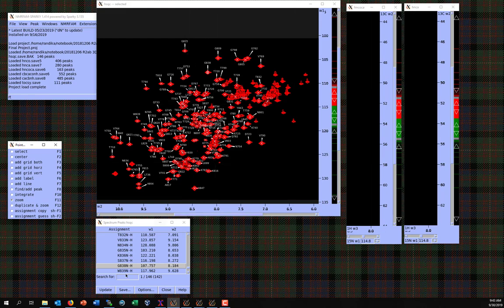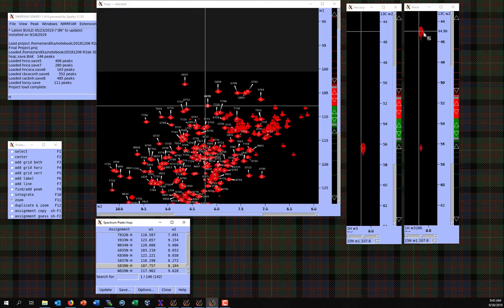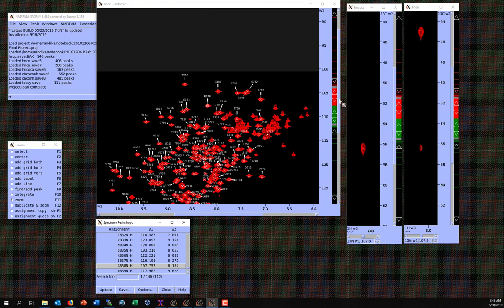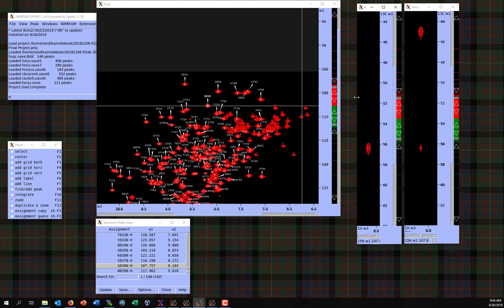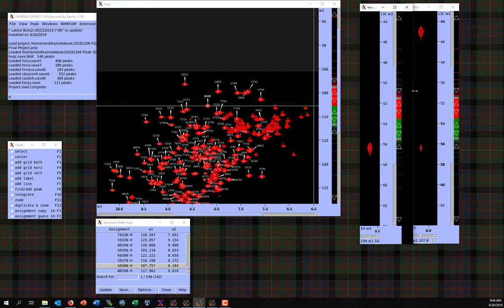So now what we need to do is start finding these residues. We're going to start with residue 838. As you can see, it looks beautiful here. Here is our HNCA. We get the I and the I minus 1 peak. Here's the HNCOCA. You just get the I minus 1. I'm going to adjust the window because I don't think we need this much space. If you're doing a single strip, that's probably fine, just to do it by eyeball.